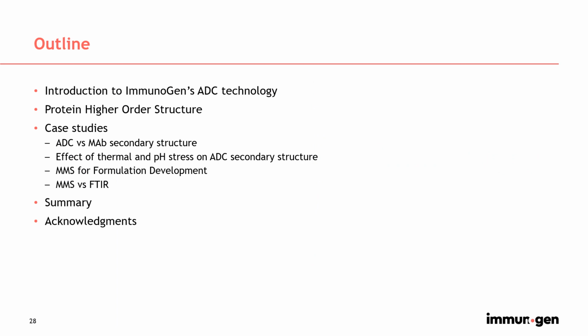I will start with a brief introduction to Immunogen's ADC technology and then discuss the basics of protein high order structure before moving on to specific case studies where we used MMS to study the ADC and antibody and the effects of thermal and pH stress on secondary structure. We also looked at some applications of MMS for formulation development and compared data directly with FTIR. And then finally, I'll conclude with the summary and acknowledgements.